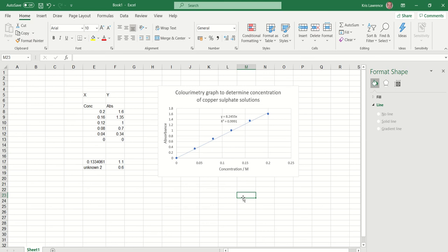And voila — you have your colorimetry graph plotted. You've got your calibration curve, you've used the formula of the line to solve the concentration of the unknowns. Submit, hand in, and passed. Thank you.